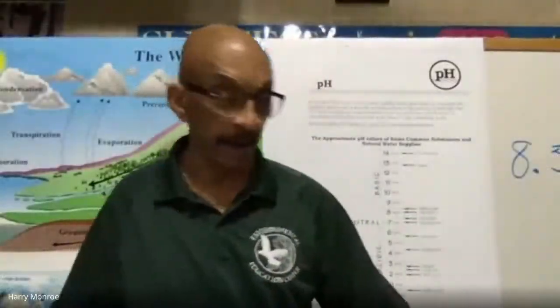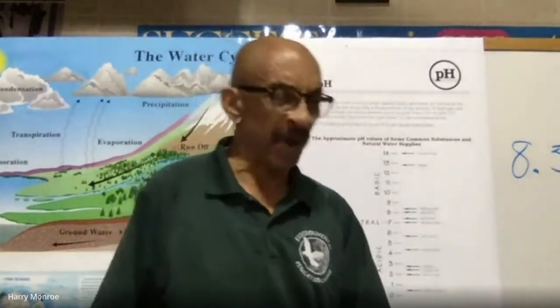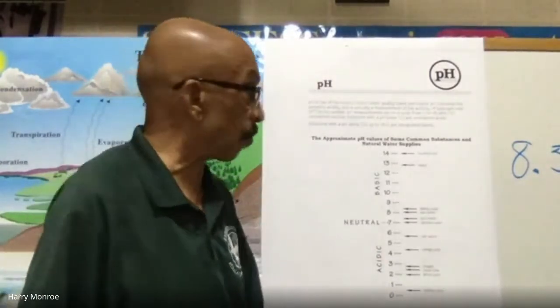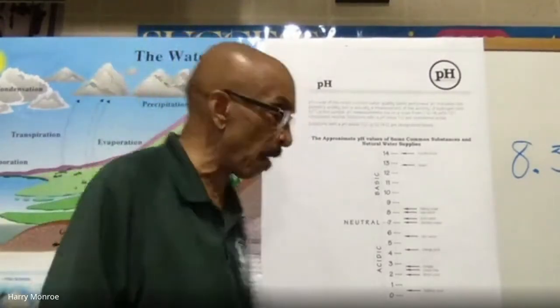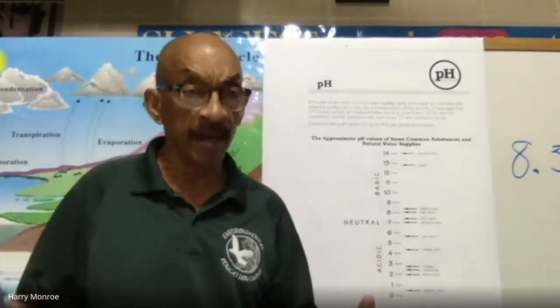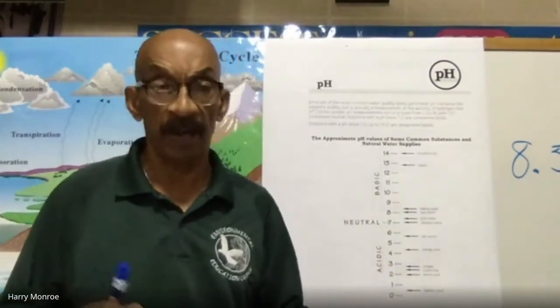That was me, Mr. Monroe, doing my part of your virtual field trip today with us, doing a test for pH. And I will tell you this, pH is a very important test to run on some substances, especially fresh water. It's probably the most common water quality test that is performed, simply because it can be used as an indicator letting you know that something is chemically changing in that water.